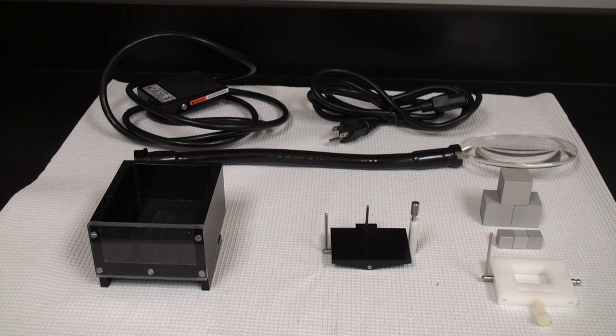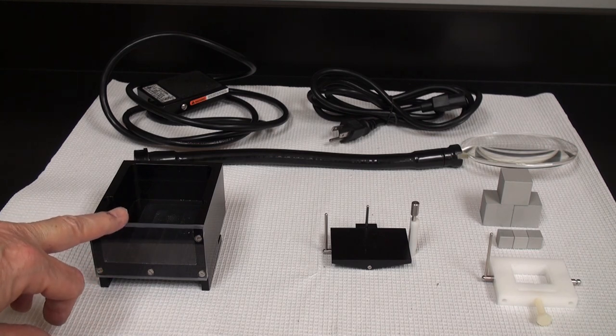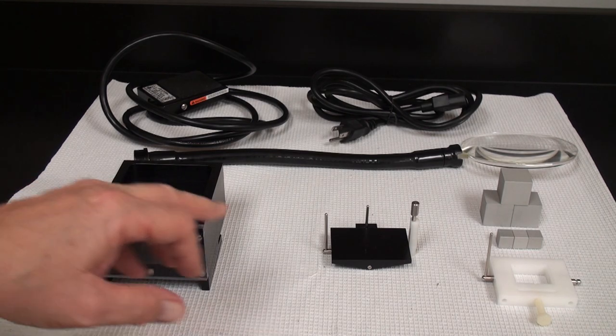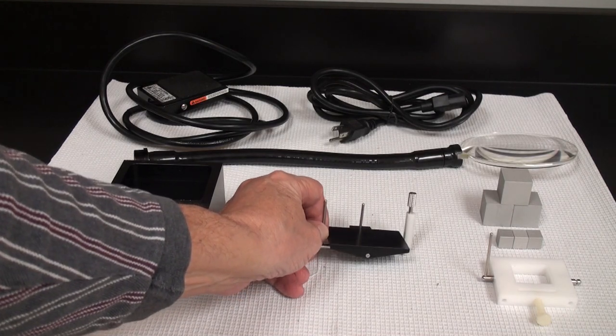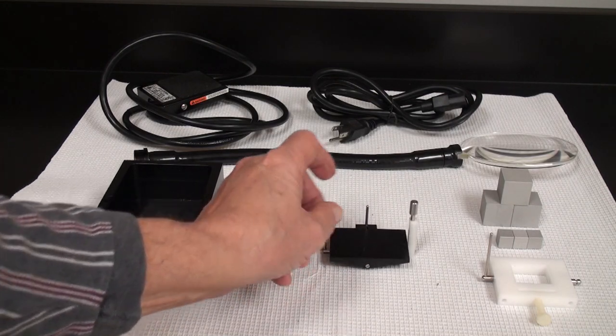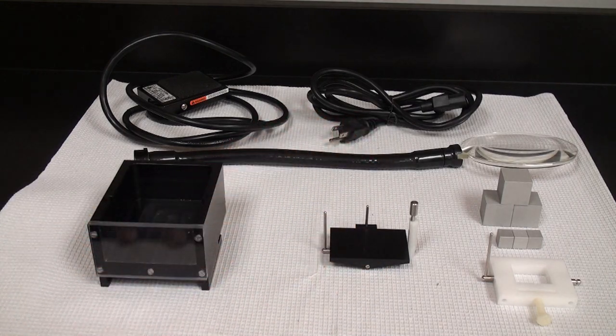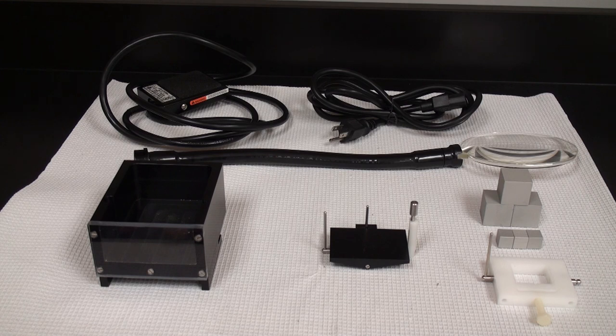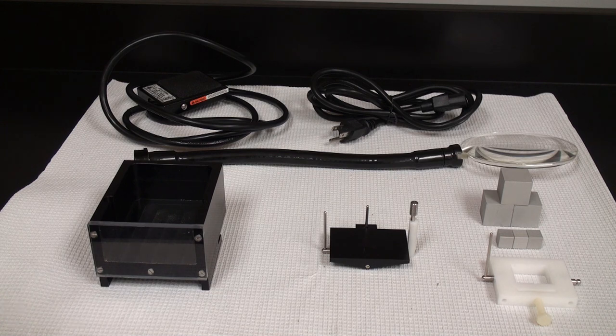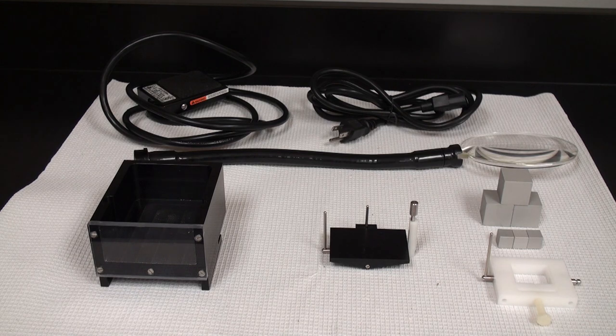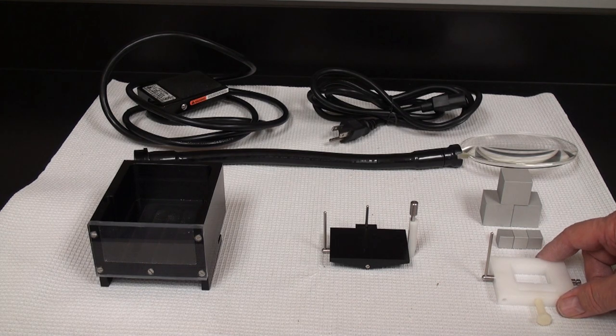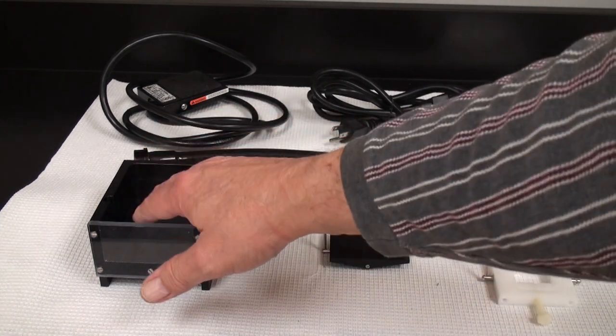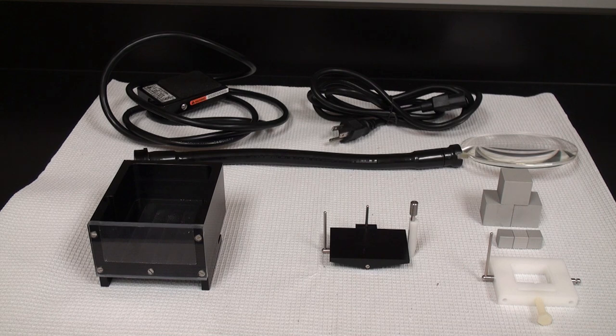These are the accessories that come with the 5000 tissue slicer. Here we have the sectioning tray. Here we have the tiltable specimen stage which you can mount your sample and do small tilt variations to correct for angle differences that you want to remove. If you cut the brain slightly off angle you can correct for this. Right next to that we have the tissue block holder. Both of these items fit into the sectioning tray.